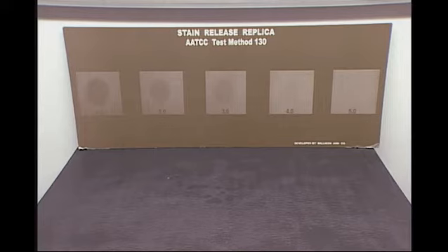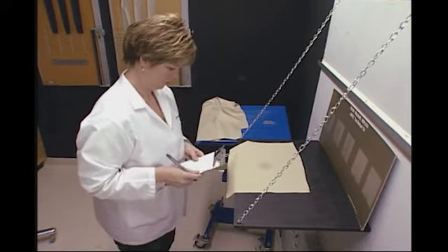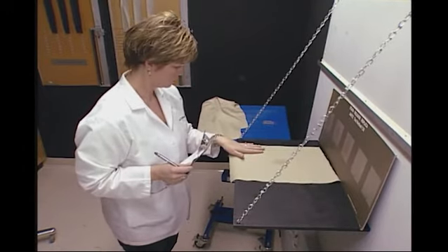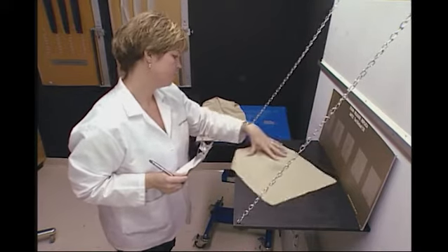For the last point, Test Method 130 developers decided that a visual scale was the best way to rate stain release after laundering, as it was known that stains can diminish at different levels. Test Method 130 allows for the use of either AATCC's Stain Release Replica, developed by Milliken Research Corporation, or the 3M Corporation Stain Release Rating Scale.